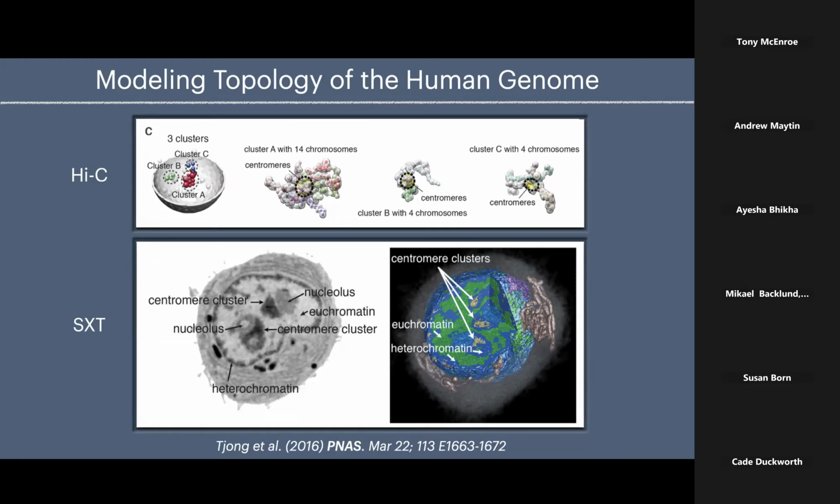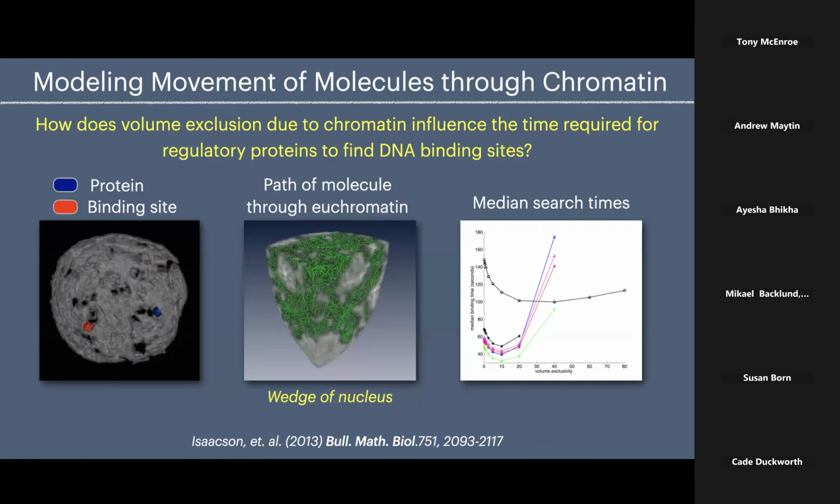And he came up with 3 different models for how the chromatin would be folded. He was first focused on the centromere protein and showed that there's a model where you form 3 different clusters of centromere protein sitting around. And it turns out that these 3 clusters, we were able to see them with the X-ray microscope. Now, this is not the same cell exactly, but he had the GM cell that you can get from the company that they guarantee is diploid when they send it out. And you can see that this matches his model of 3 centromeres in these B cells.